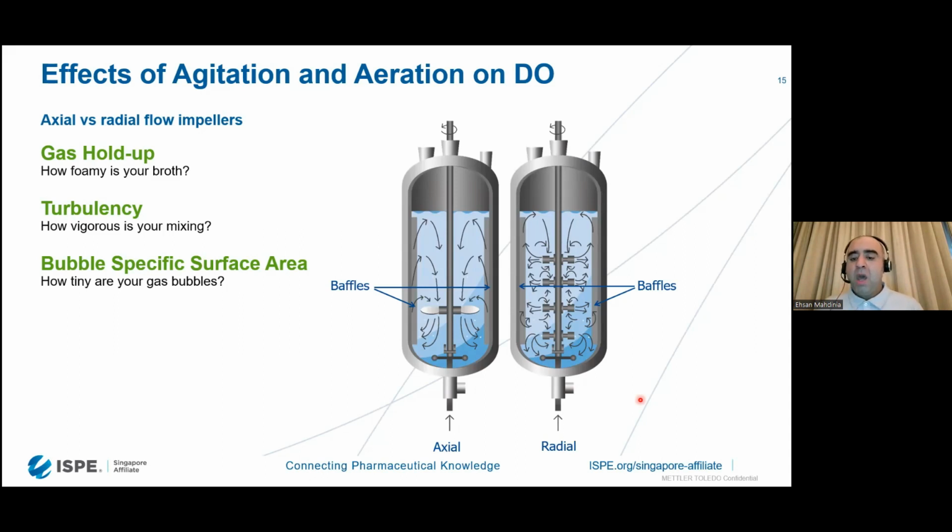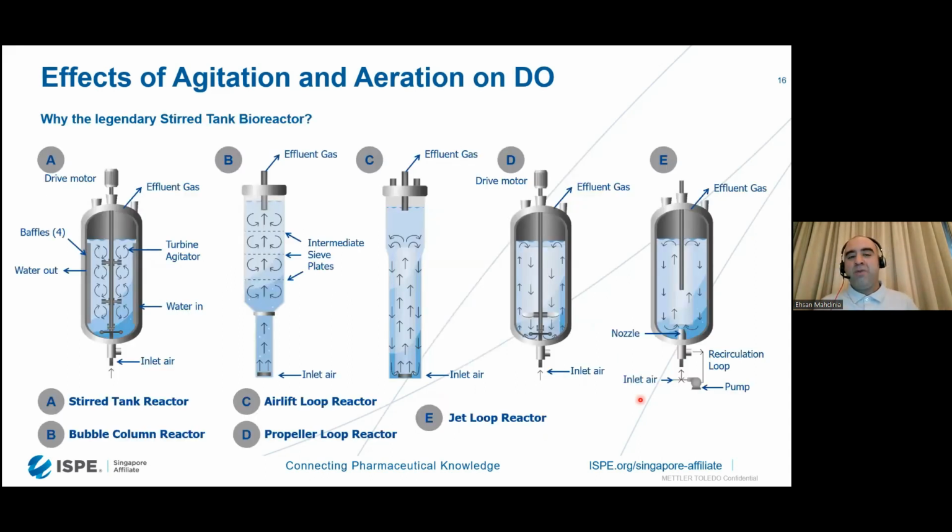So when the legendary Danny Wang and Art Humphrey, the pillars of biomanufacturing, back in the 70s and 80s, were selecting the right candidate design of the bioreactor for the biomanufacturing industries that were coming into the picture, they had many different designs available to them. Bubble columns, or fluidized bed bioreactors, were big at the time, but they were smart. They knew that once you start scaling up the bioreactor to the humongous scales we have today, 30,000 liters, 40,000 liters, very common in fermentation and cell culture, and in fermentation we can go all the way to 150,000, 200,000 liters, the real challenge would become heterogeneity, and keeping it homogeneous would be the real challenge. And they were right.